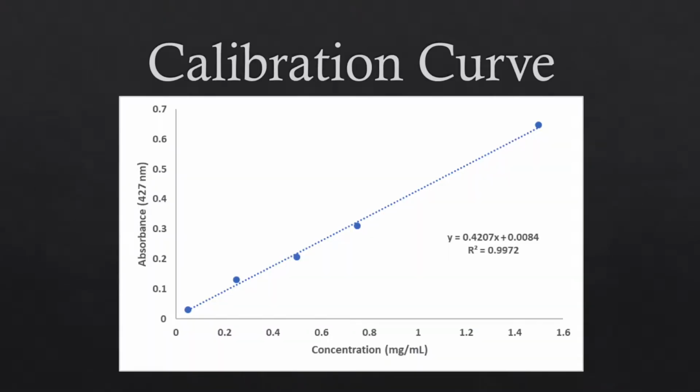To determine the concentration for the collected absorbance values, a calibration curve was created. The calibration curve was produced by making known dilutions of sample and collecting the respective absorbance values. Looking at the linear regression of the absorbance data, we are able to determine the correlation between absorbance readings and their concentrations. Looking further into this regression, it is positive to have a y-intercept value that is close to 0. This suggests that the calibration data is appropriate for all absorbance readings.